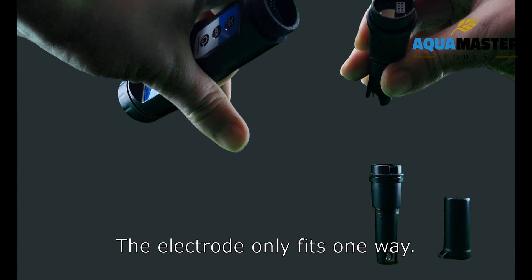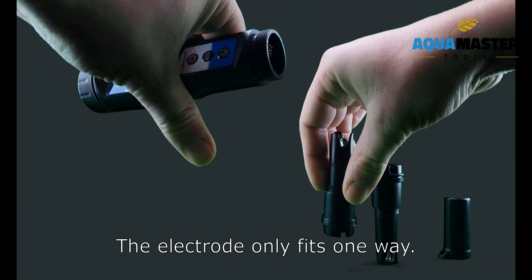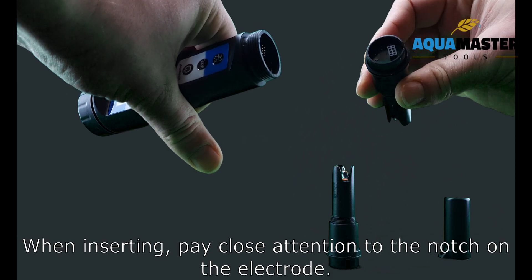The electrode only fits one way. When inserting, pay close attention to the notch on the electrode.